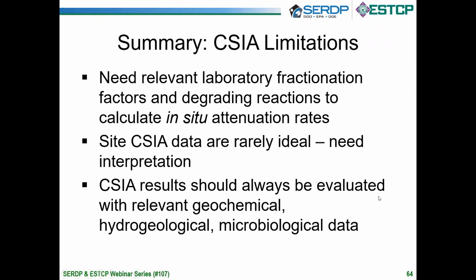And the final point, these results should always be evaluated with geochemical, hydrogeological, and microbiological data. You don't want to use isotope data to propose anaerobic degradation of VOCs in an aerobic aquifer, right? It makes no sense. So all of this should be used in light of what you already understand about your field site or your situation, but it can be excellent supporting information.